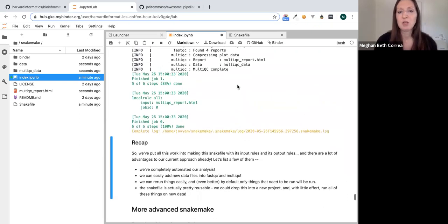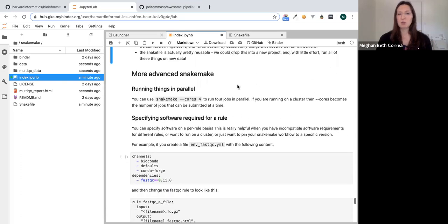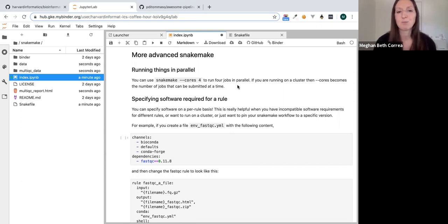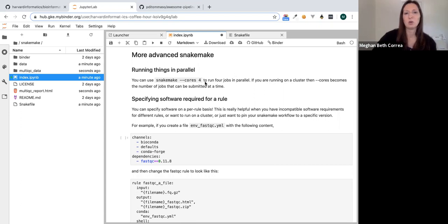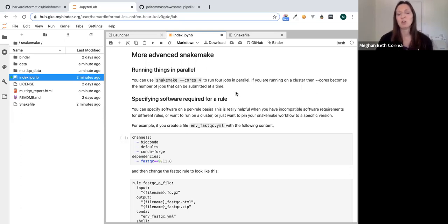Now I'll quickly touch on some more advanced things we're not going to actually run. On running things in parallel: when running locally everything runs on the local machine, but you can also run on a cluster. If you add the cluster option to your Snakemake command, the cores value becomes the number of jobs you can submit to the cluster at one time, so you can often set that higher than what you'd run locally.